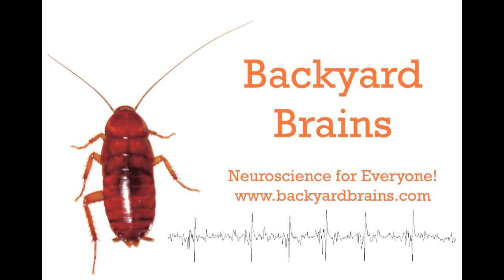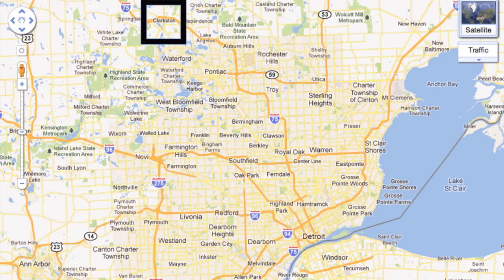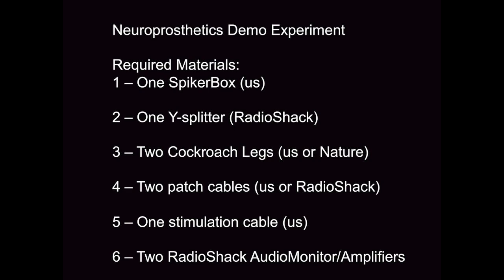Backyard Brains brings you a new experiment demonstrating principles of neuroprosthetics. We thank the students of Clarkston High School for suggesting this to us. Specifically, we will use the neuronal output of one leg to control the muscle activity in another leg.